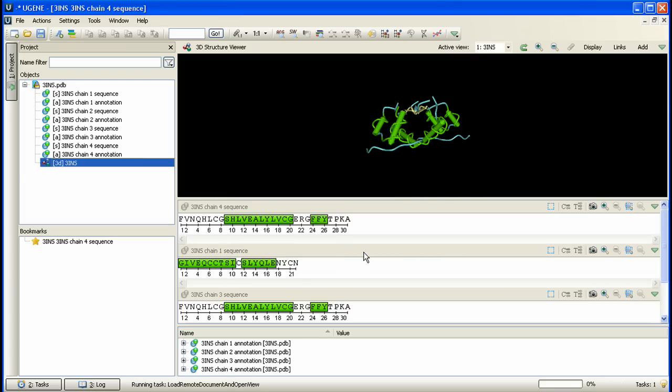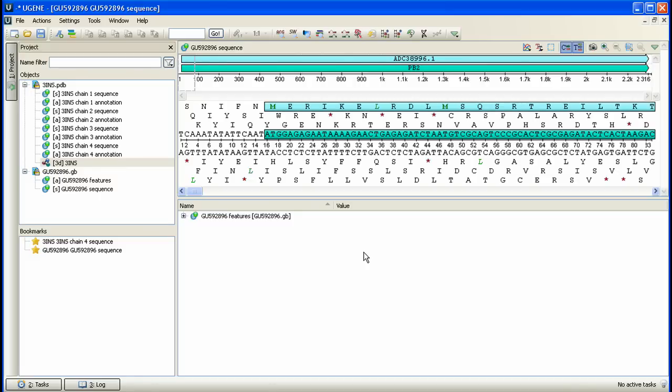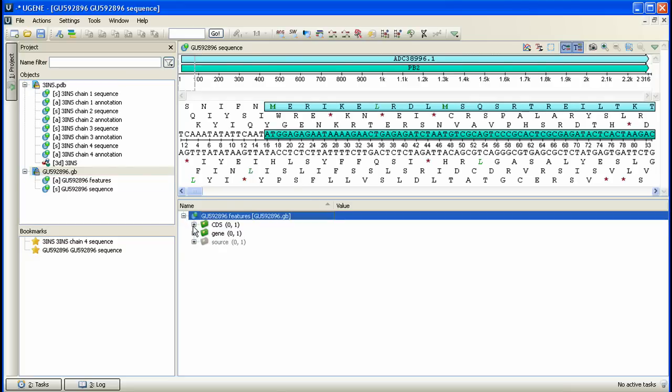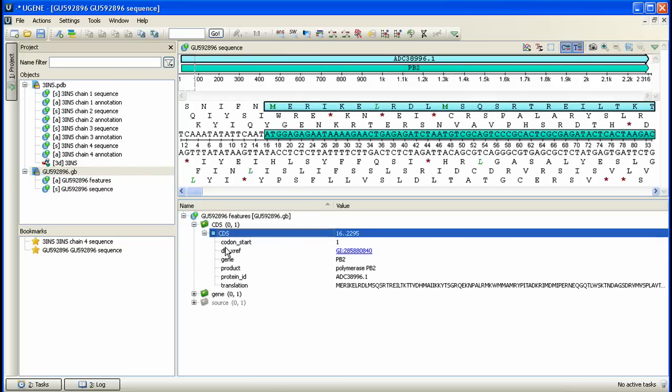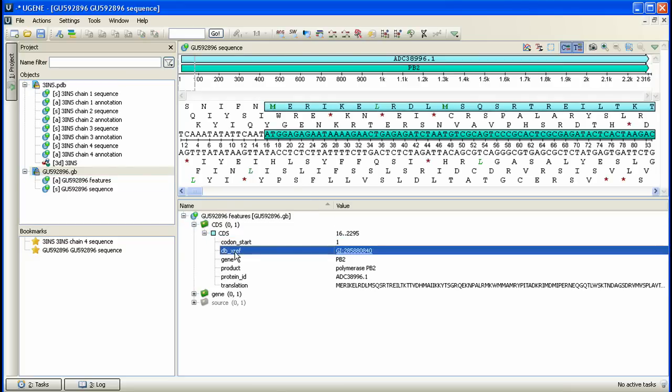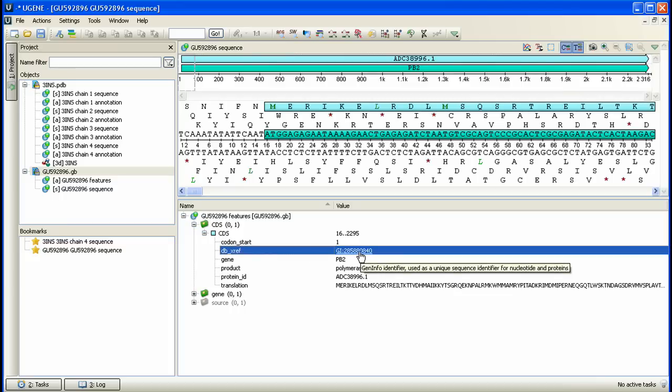The GenBank file has been added to the project and its sequence view has been activated. Let's unfold the CDS annotation qualifiers. We see dbxref qualifier among them with a hyperlink value. The qualifier value is a reference to a database entry. If we click on it, we will browse the database entry corresponding to the qualifier annotation.